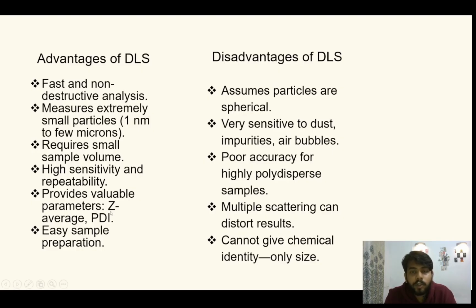It provides valuable parameters like average size in terms of hydrodynamic diameter. It gives us PDI and the size distribution curve. It is very easy and simple to use, and sample preparation is also very easy.